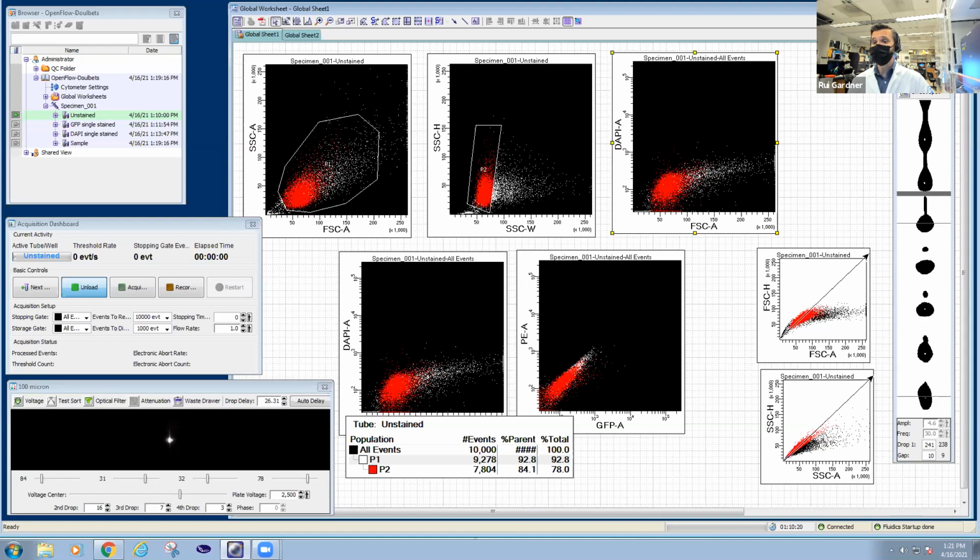And actually, I usually cite this guy called Derek that I remember once you told me that you used side scatter height versus forward scatter area, something like that. So you used a combination of those. I tend to use forward scatter height, forward scatter area, and side scatter width, which works quite nicely on the BD machines, because it also depends on the geometry, obviously, of the optics in there. So today for simplicity we're actually just using side scatter, but you're right, we could use really anything that we want.